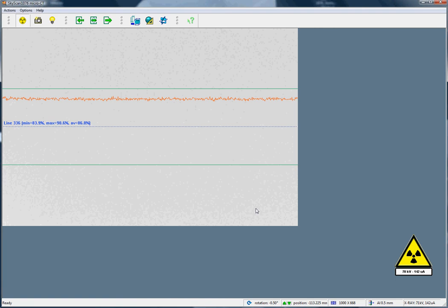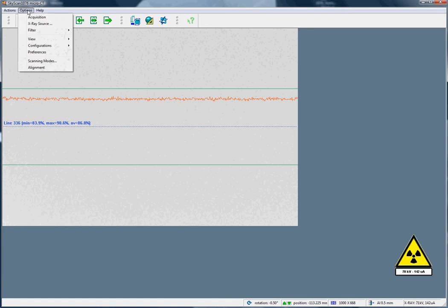And it's as simple as that. It's a very good idea at the beginning of each day's scanning to refresh the flat field correction in the 1076 scanner. This is very easy to do, as we've just seen.